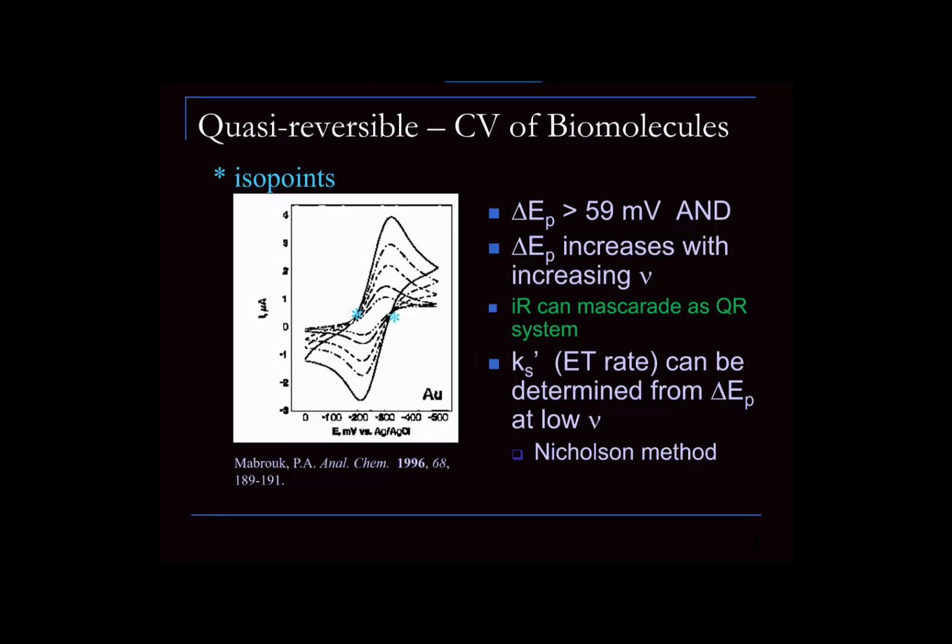And what you want to see is that there are 5 voltammograms here representing different scan rates. The highest, largest one is the fastest scan rate, and they scale downward to very, very slow scan rates. You'll see some blue asterisks on the left and on the right, and they're intended to mark the 2 points on the left and the right where all of the voltammograms overlap.